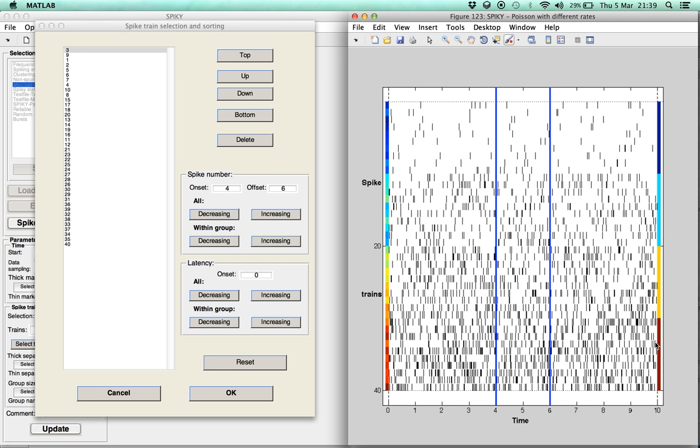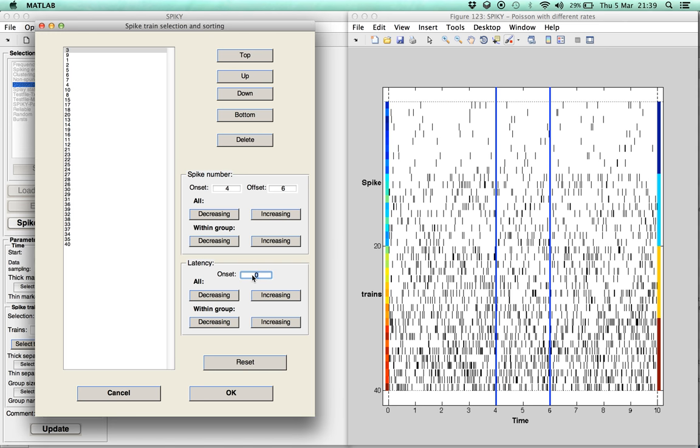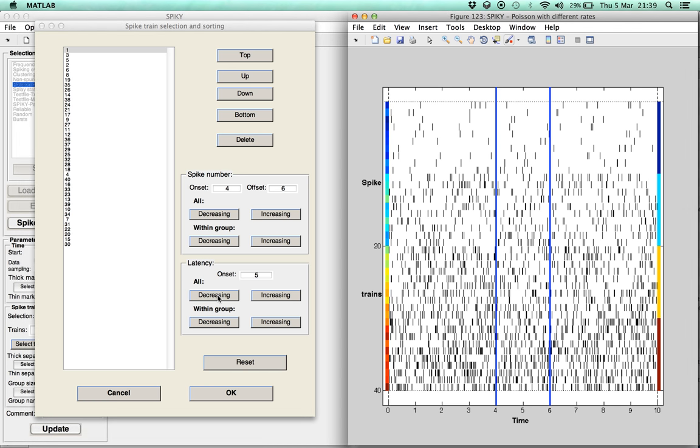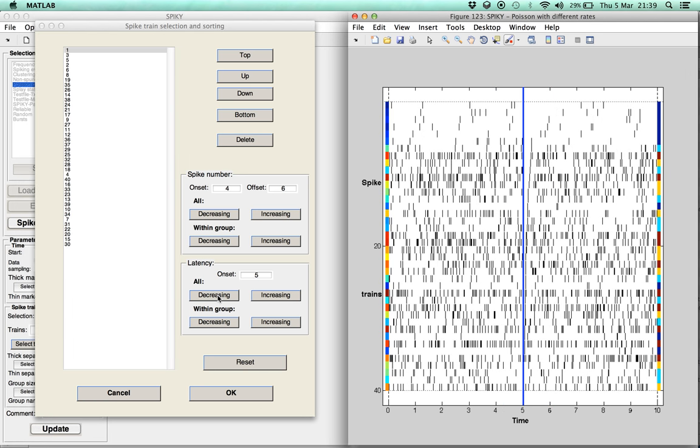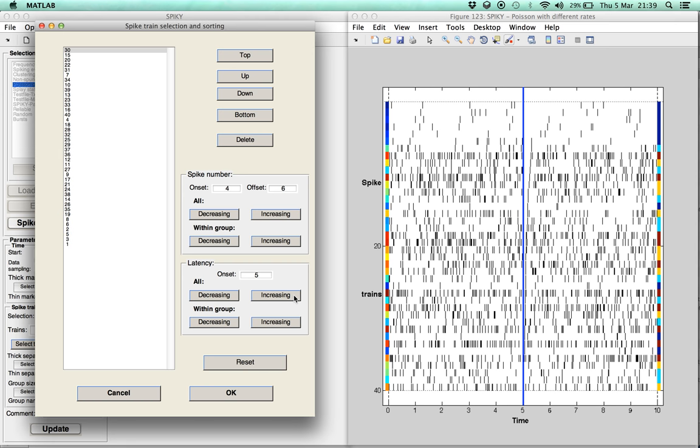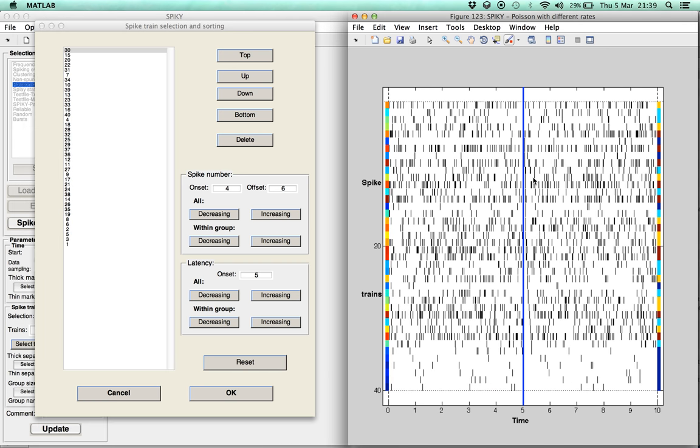For the second criterion, latency, there is only the onset to choose. Here we set it to 5. Then again, for all spike trains, we can let it either decrease or increase. And the same again within each group separately.